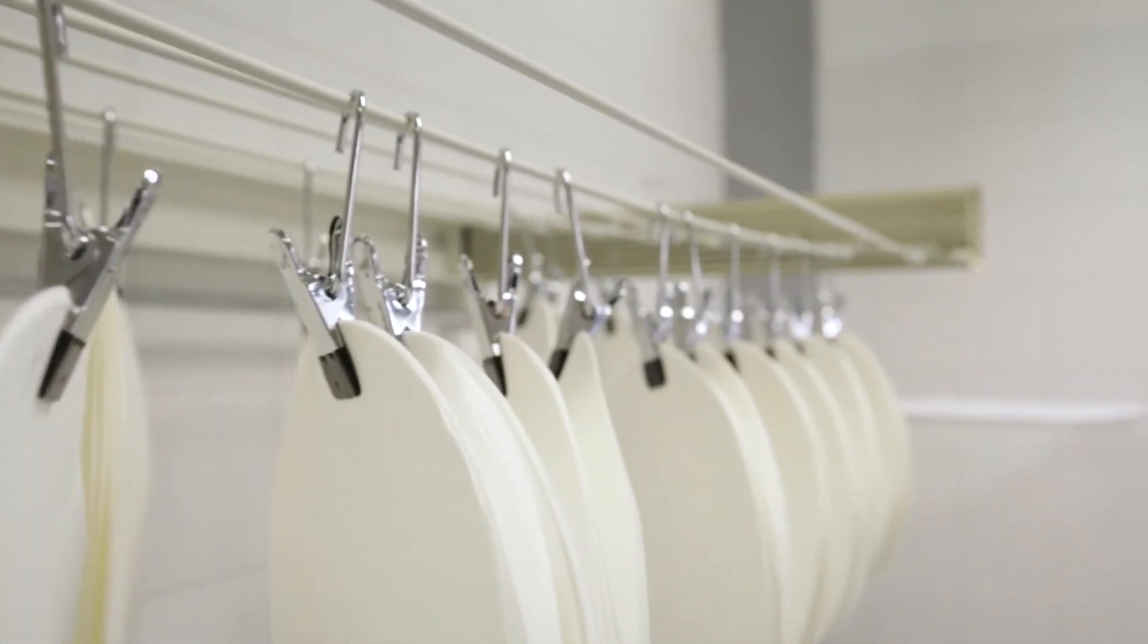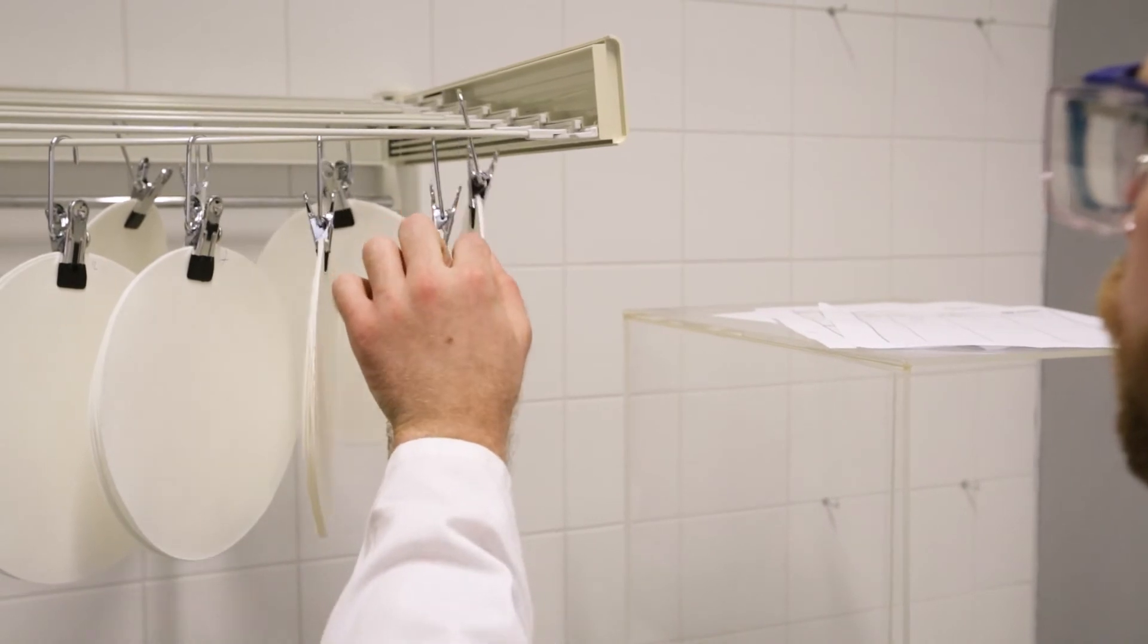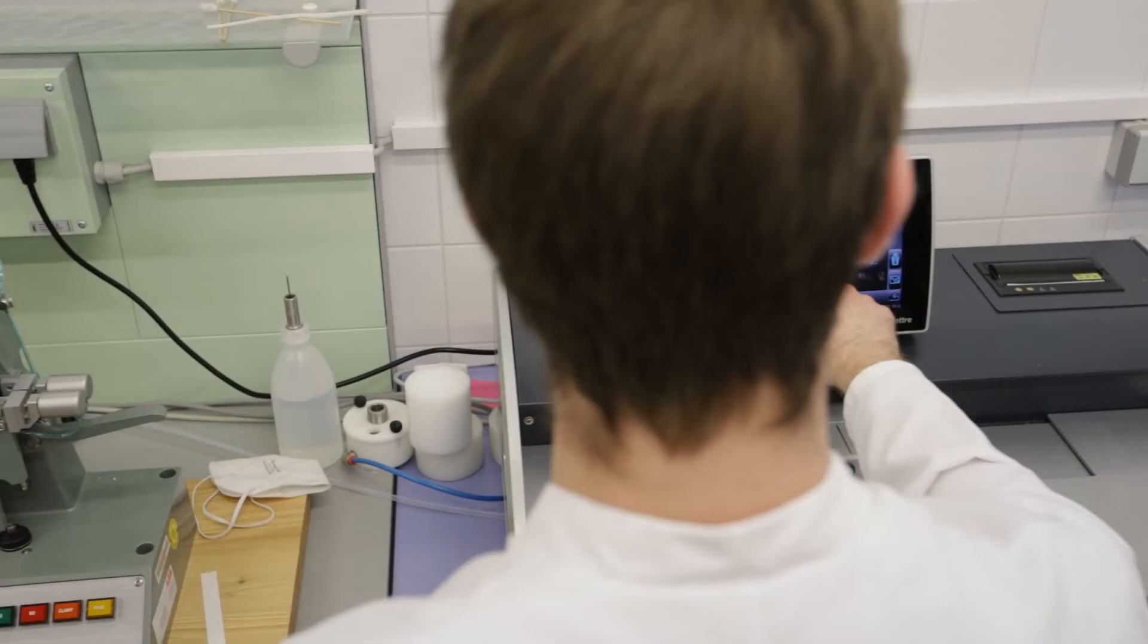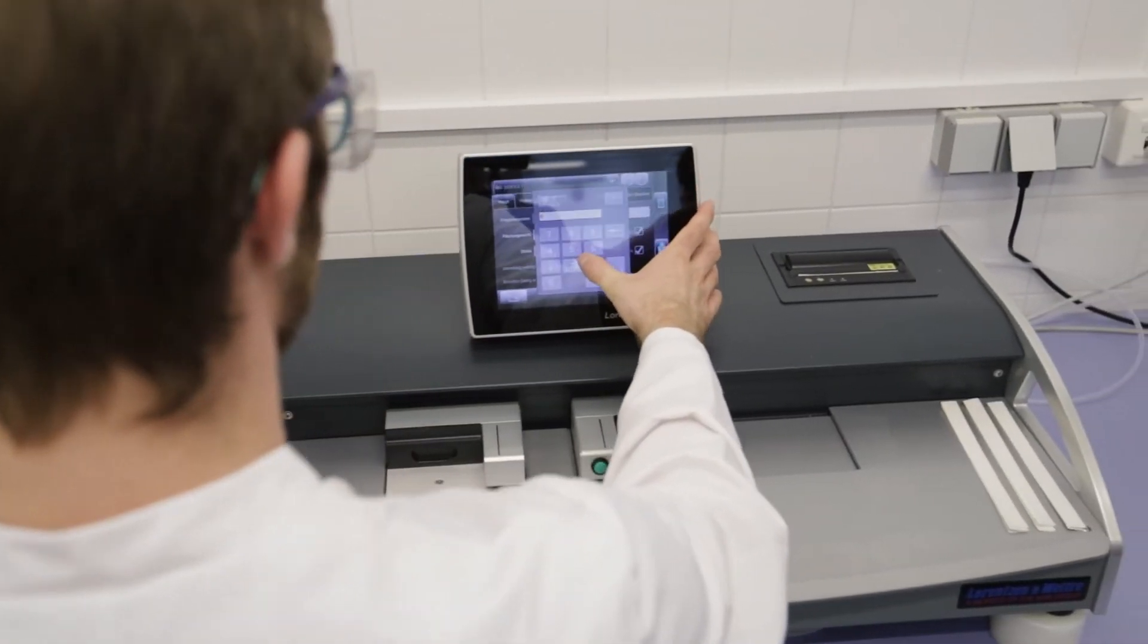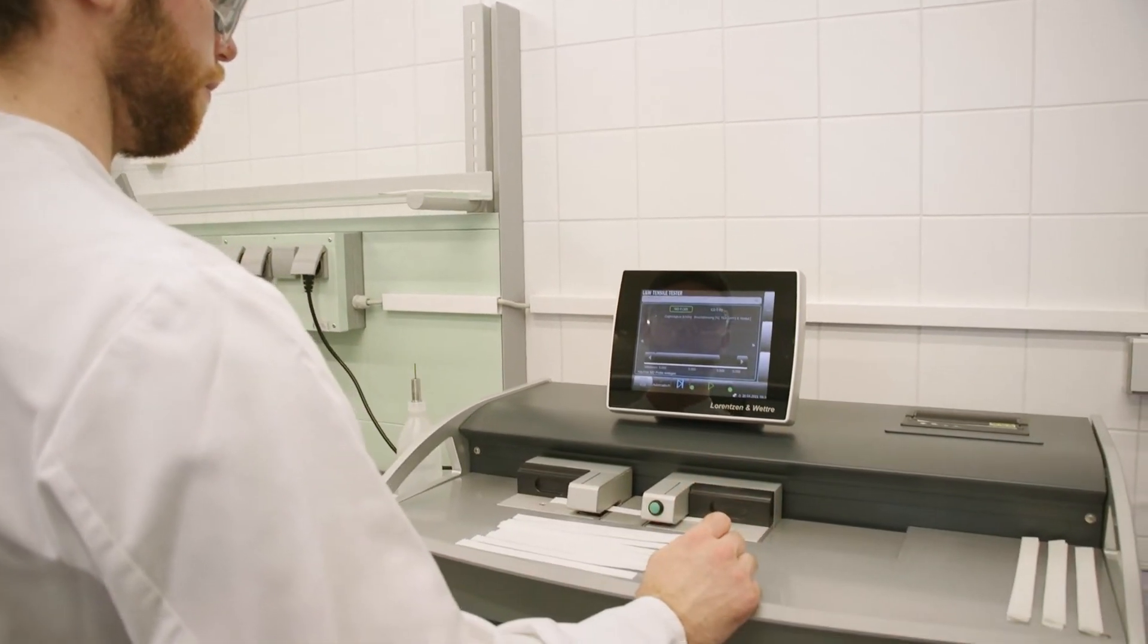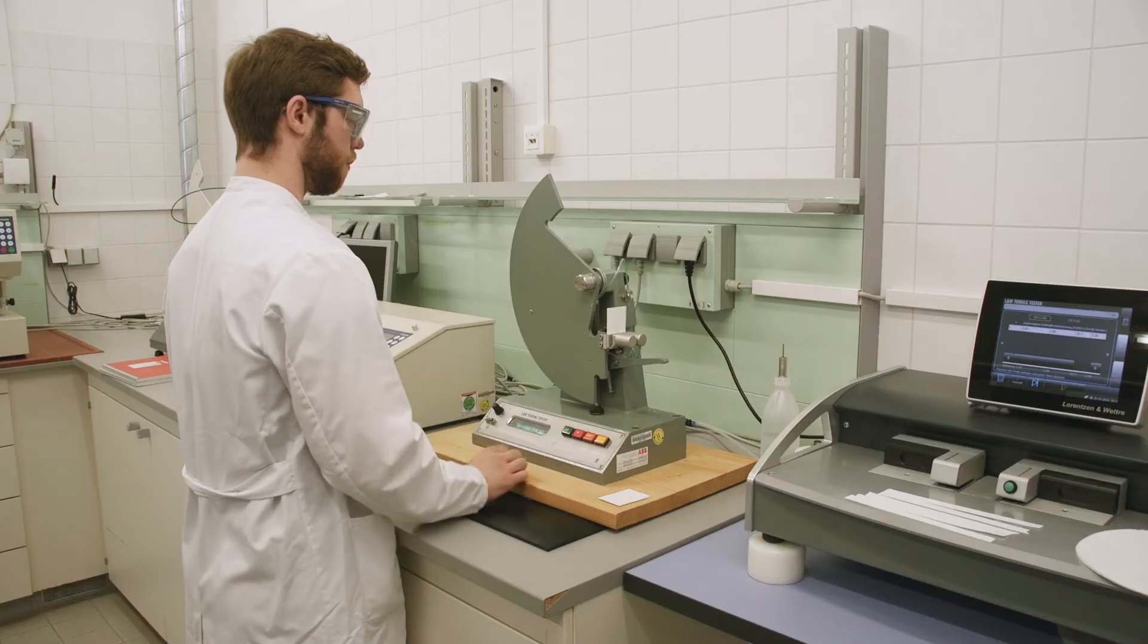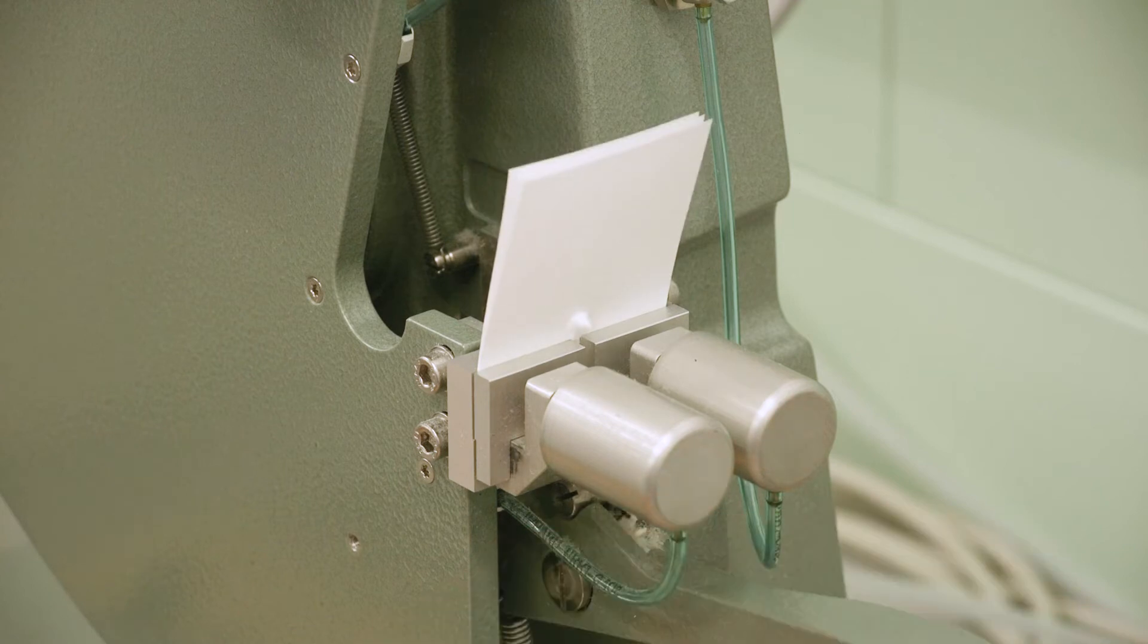The laboratory sheets are air-conditioned for at least 24 hours at standard conditions before evaluation. The sheets are cut into different specimen sizes, dependent on the test. Typical strength values are breaking length and tear resistance, according to Elmendorf.